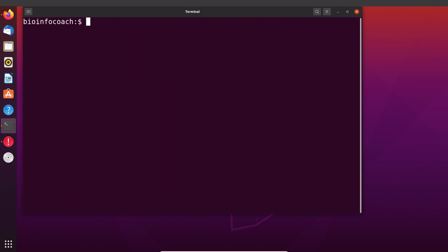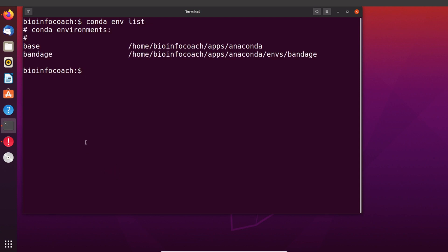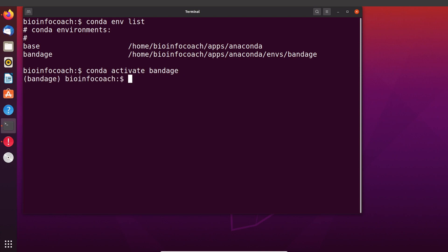If you want to test Bandage you have to activate the environment, and in case you have forgotten the environment name, you can say conda env list — this will list the environments you have on your system. So this is the environment we created. We are going to activate it by saying conda activate bandage. Now the environment has been activated, so we can call Bandage. We say Bandage — the B is uppercase — and then we execute it.